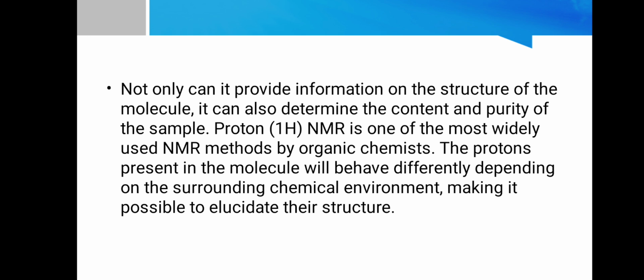Not only can it provide information on the structure of the molecule, it can also determine the content and purity of the sample. Proton NMR is one of the most widely used NMR methods by organic chemists. The protons present in the molecule will behave differently depending on the surrounding chemical environment, making it possible to elucidate their structure.